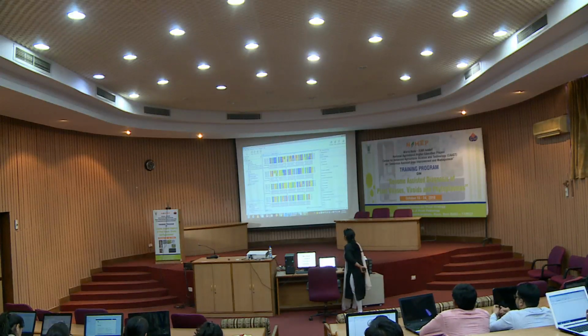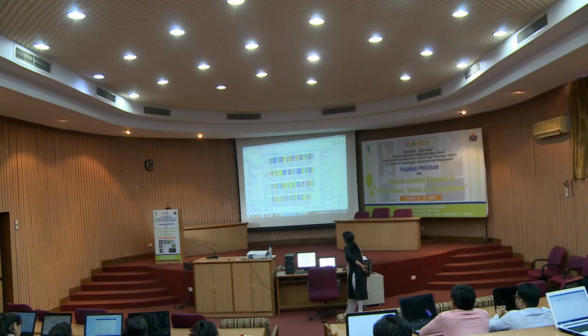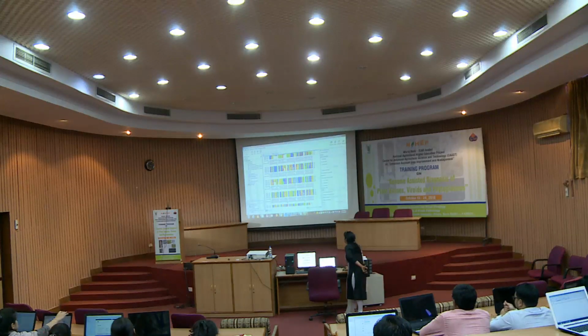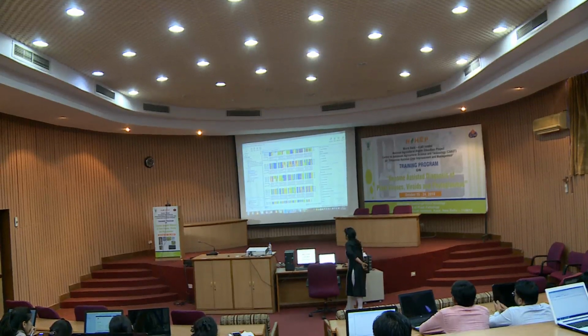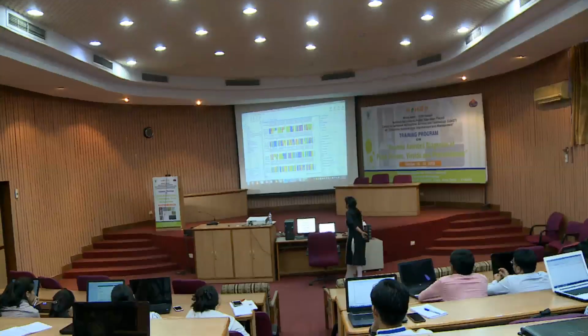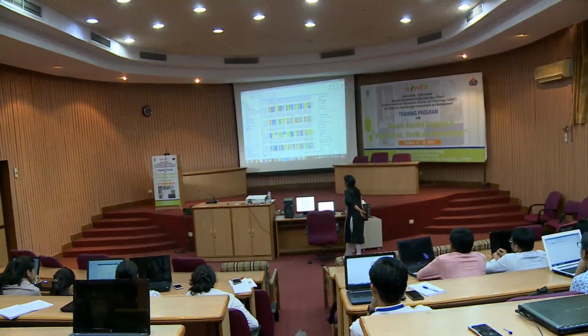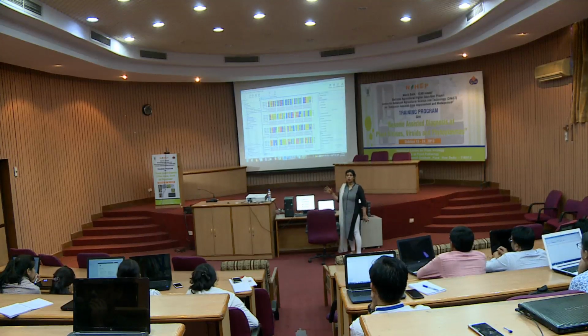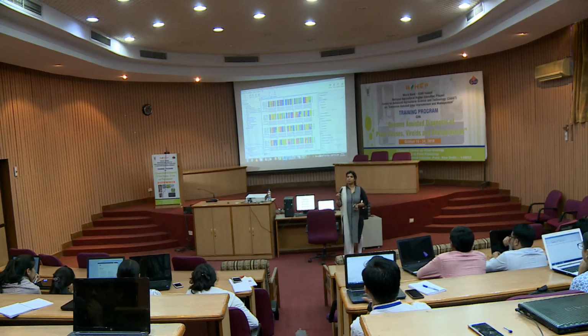I showed you these samples because here you can see the variability and the deletion also. This variability, in some it is T, in another it is A. If you go further up, here it is G, A, these 2 bases are inserted over here, the base insertion is there, here also the insertion of a stretch is there, here also, right. So, this is how we have prepared our file for GenBank submission. This is the nucleotide form of that file.